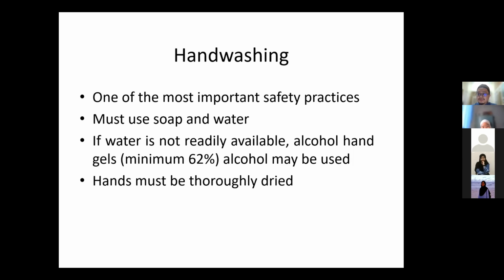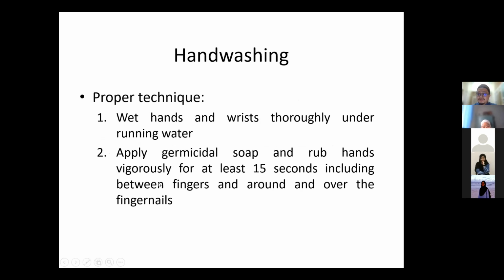So if you use soap and water, that actually already enough to get rid of many biological organisms. And then after we clean, we must thoroughly dry our hands. Yeah, proper technique, wet hands and wrists thoroughly. Kita kena wet dulu sebelum letak sabun tu. Jangan letak sabun masa tangan sedang kering. Okay. Apply the soap and rub hands vigorously for at least 15 seconds.